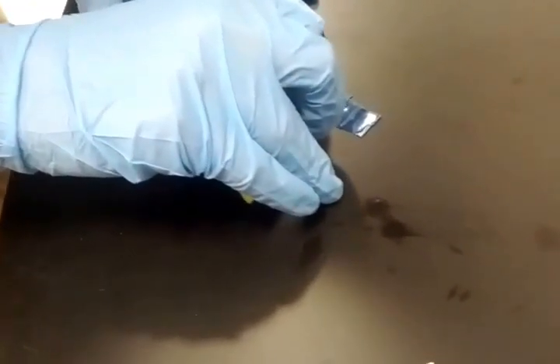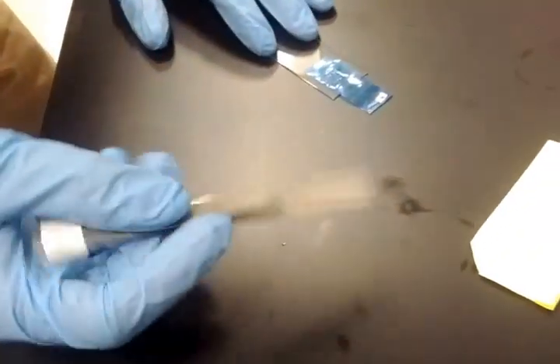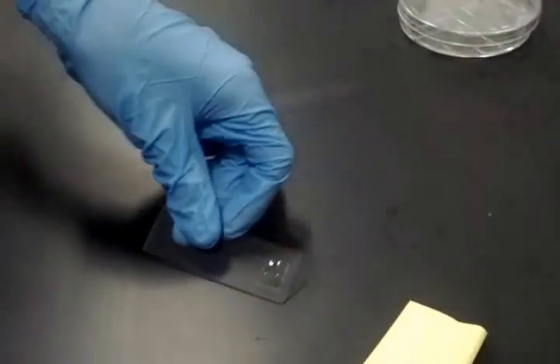Okay, some more pressure. Okay. Now I'm going to remove the tape relatively quickly. And if you can zoom here, there's a good amount of shiny crystal. Okay, you can stop.